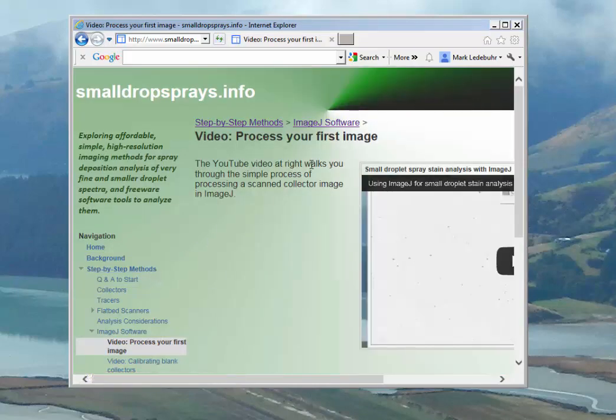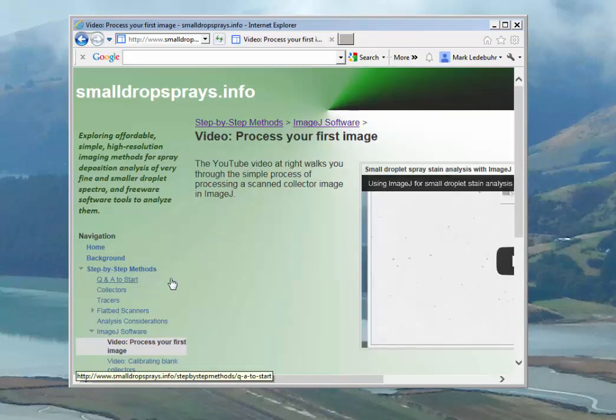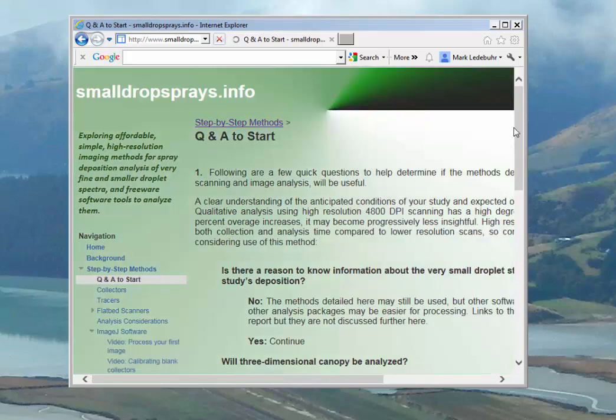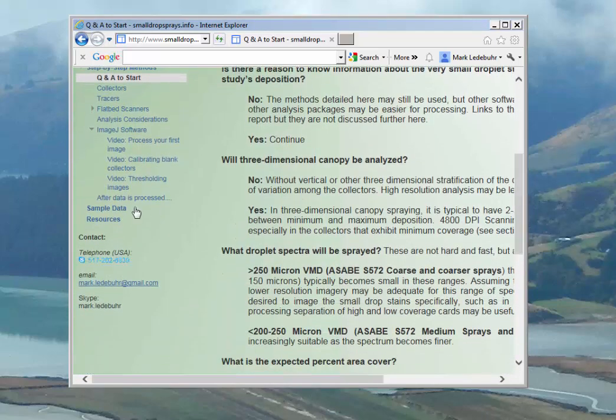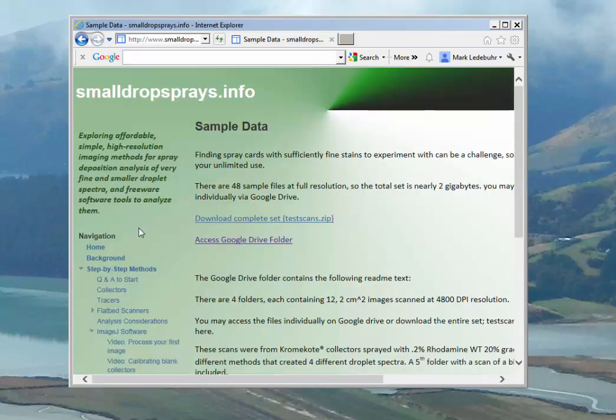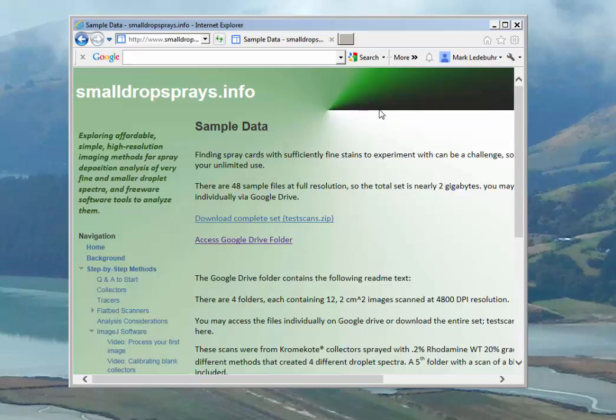The third thing you should look for is sample data available on the sample data page. You can download a folder called test scans that gives you four different small data sets, blanks, and other resources that will help you have good images to work with while you're getting comfortable with the ImageJ software and the procedures defined here.